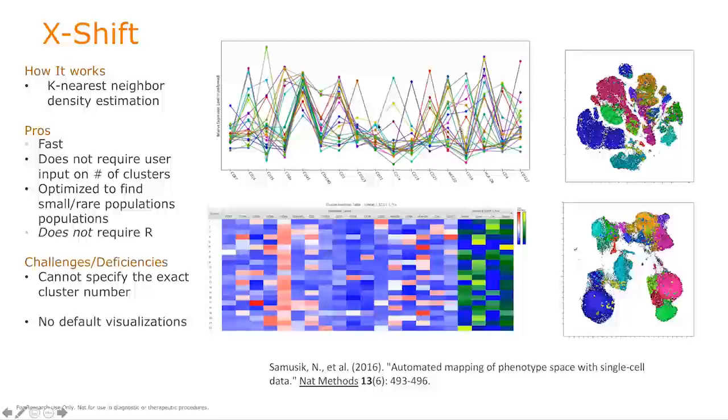This is a parallel coordinates plot that you can gate within, and each line represents a different population here, showing the expression pattern similar to the heat map, but in a different visual. And then this is a heat map that I can get out, which has all the underlying MFIs. In this case, I've added additional columns, which are the gates for my different conditions. So these are frequencies of each cluster across my different conditions, represented in a different color palette. These are visualizations that we can offer you through the Cluster Explorer plugin.